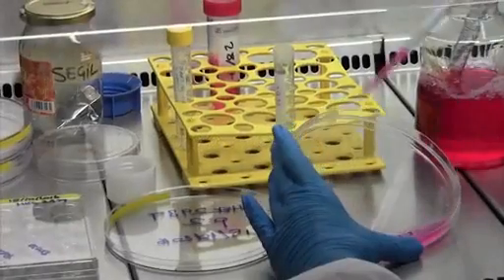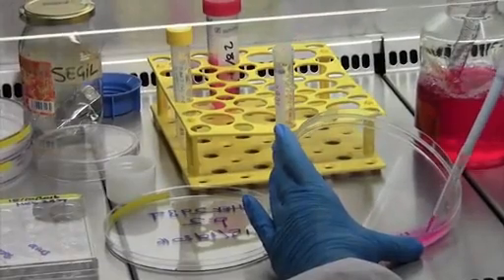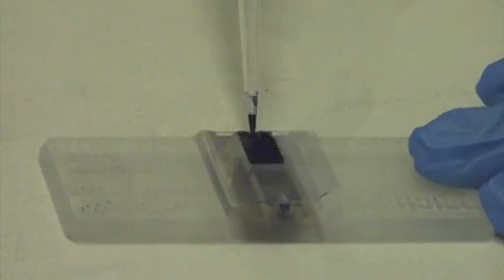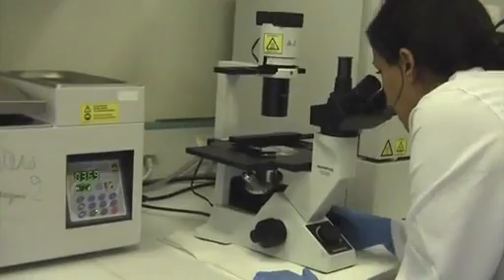To begin, detach the cells with trypsin. Then, count the cells using a hemocytometer and calculate the cell concentration.